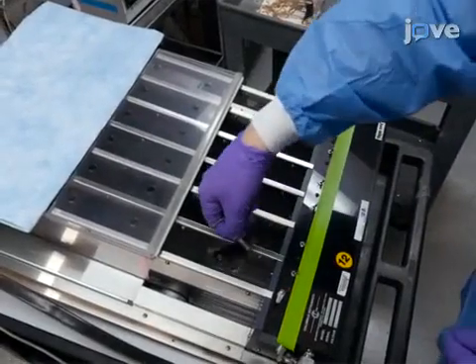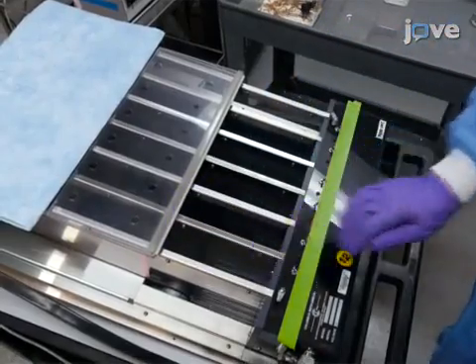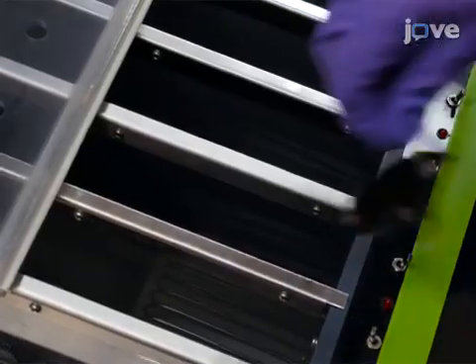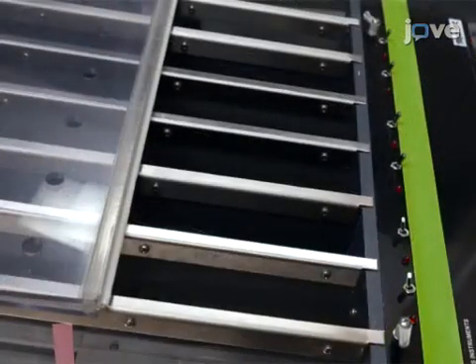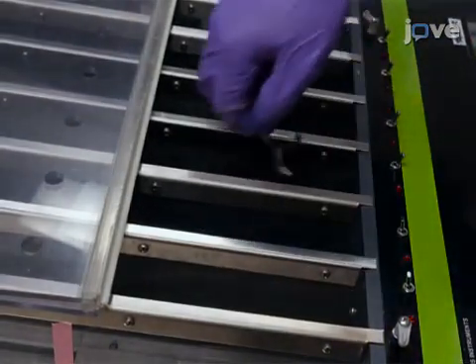With the treadmill off and the speed set to zero, quickly load the mice, holding them by their tails, directly onto the treadmill belt. After placing each mouse, promptly turn on its corresponding shock.